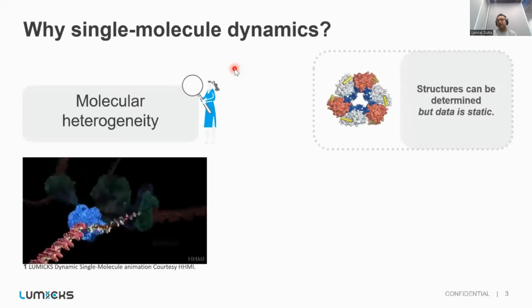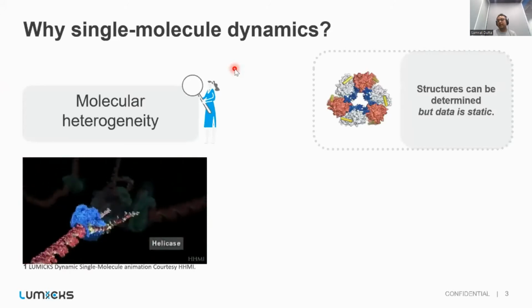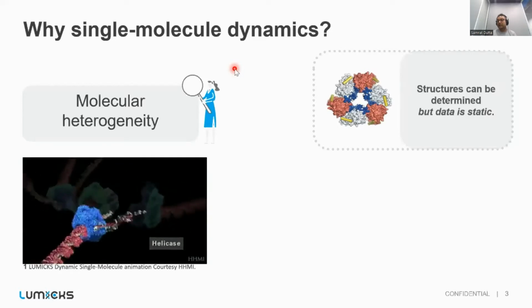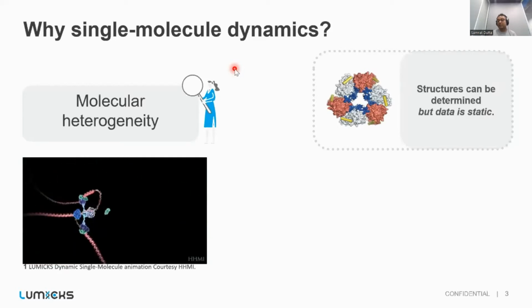So a lot of data in the last multiple decades has already been provided. The crystal structure data gives us angstrom scale resolution of the biomolecules, but however, the data does not tell us about the dynamics, like how the structure evolves over time.